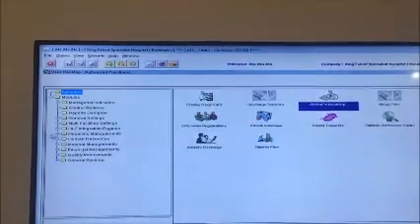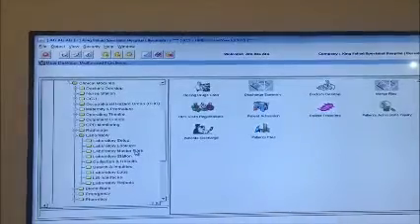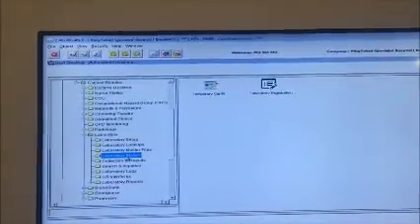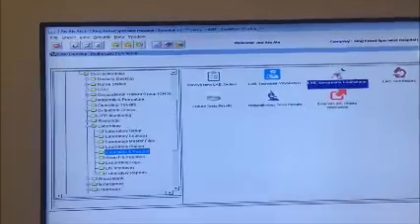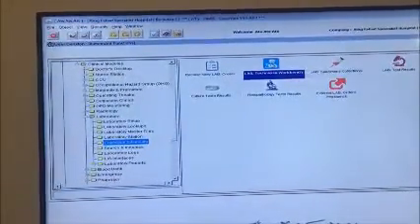The next step, I will add to favorite the screens that I needed from the laboratory. I will insert it from here, the collection, or just this one, I can do everything.